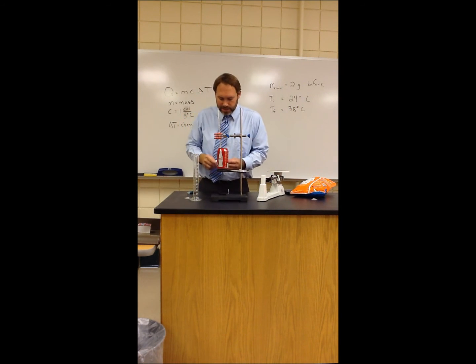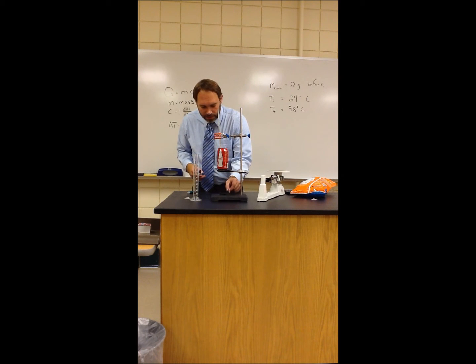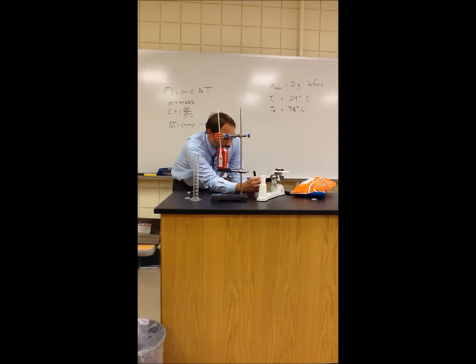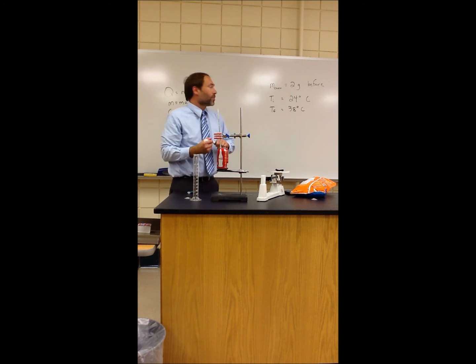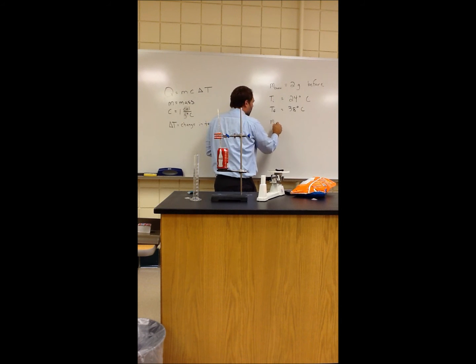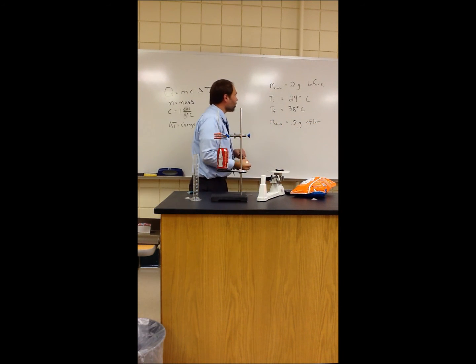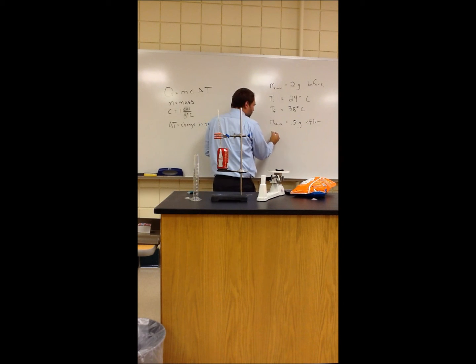And now I need a mass for the rest of the cheese puff, the burnt leftovers of the cheese puff. And the mass comes out to about half of a gram. So the mass of the cheese puff afterwards equals 0.5 grams. So the amount of burned cheese puff is 1.5 grams.